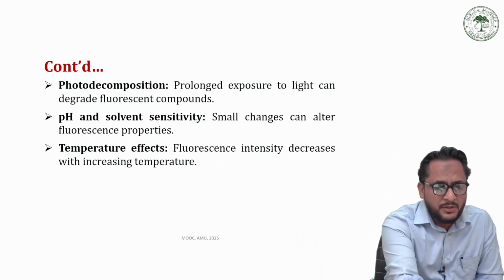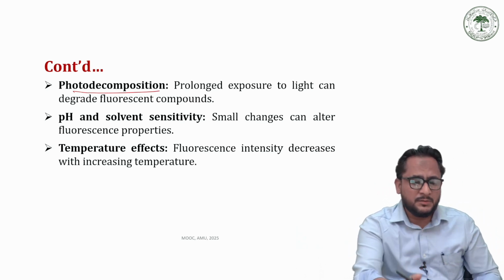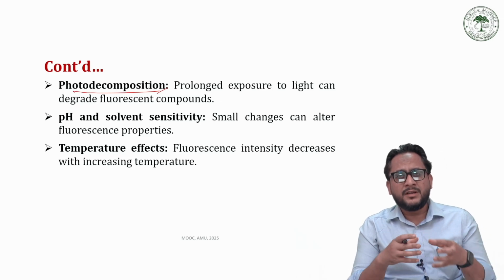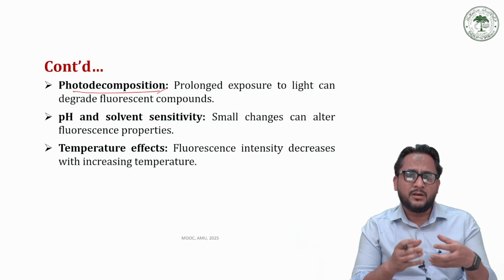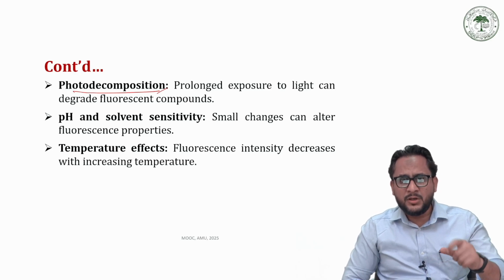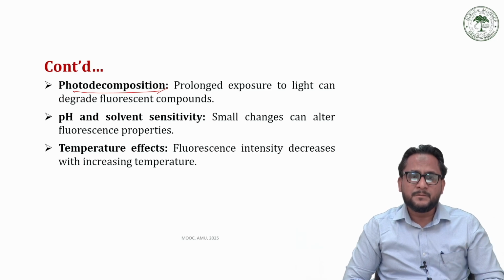Then there is a possibility of photodecomposition. That's another limitation. If we are irradiating a sample for a longer period of time with UV light or light from the visible region, upon prolonged exposure the molecule decomposes, and when the molecule does not exist, how can we identify it?